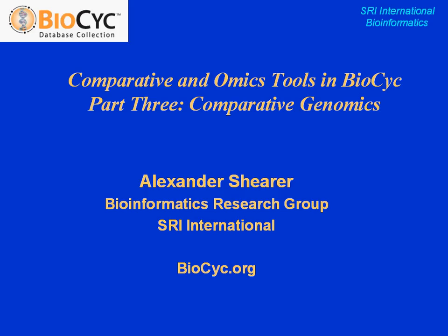I'm Alexander Shearer, speaking on behalf of the Bioinformatics Research Group at SRI International, and I'm showing off some of the features and tools available on biocyc.org. In Part 1, we introduced you to the cellular overview and showed you what you could see there. In Part 2, we showed you the cellular omics viewer that lets you look at omics data on a cellular metabolic overview. In Part 3, we're going to look at comparative genomics tools in BioCyc, specifically ways you can compare across different organisms or ways you can get some interesting information out of a single organism.